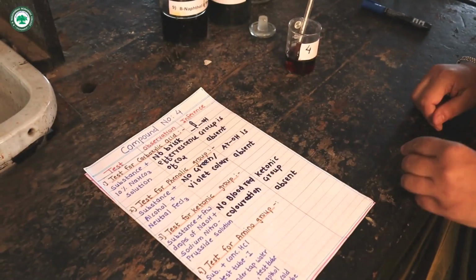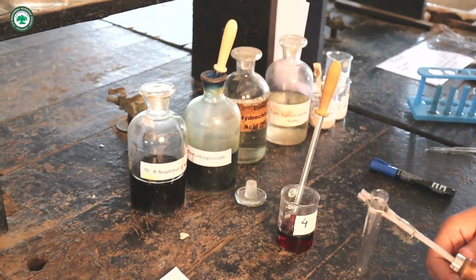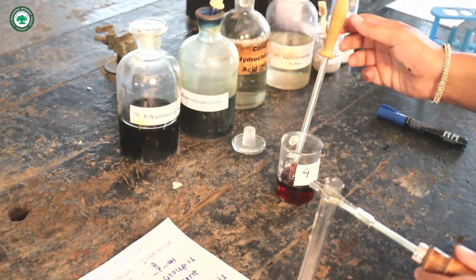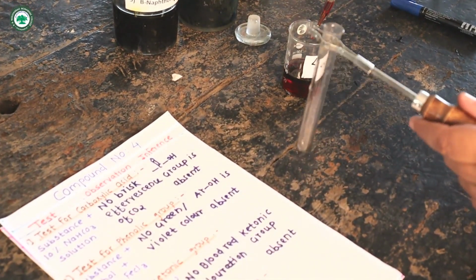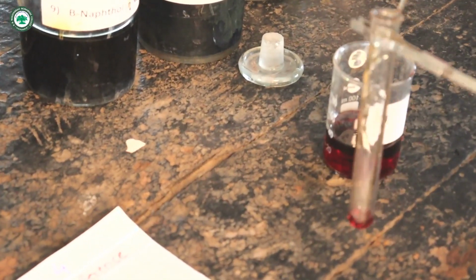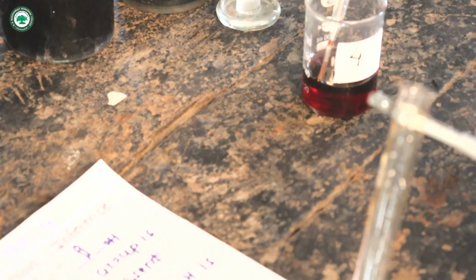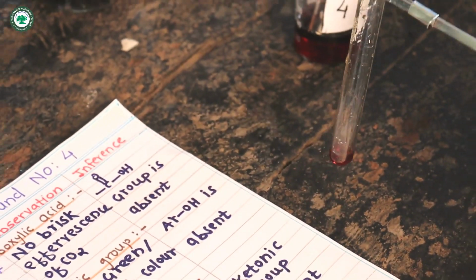Then next test for amino group. Again take a test tube with test tube holder, add compound number 4 in the first test tube. Then add concentrated HCl in the first test tube.